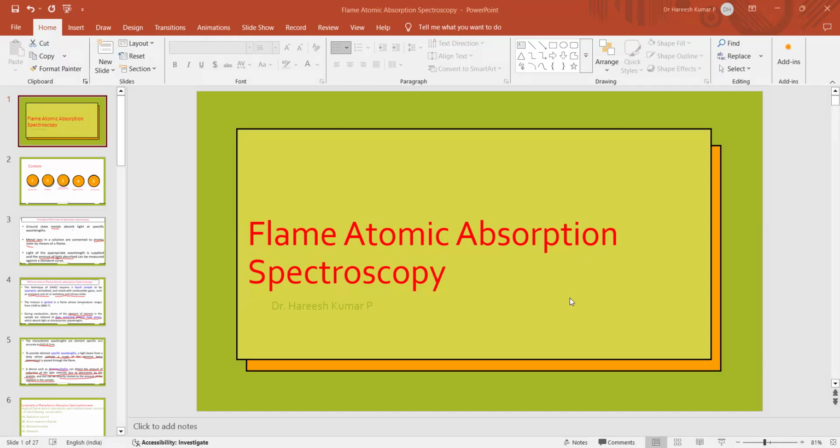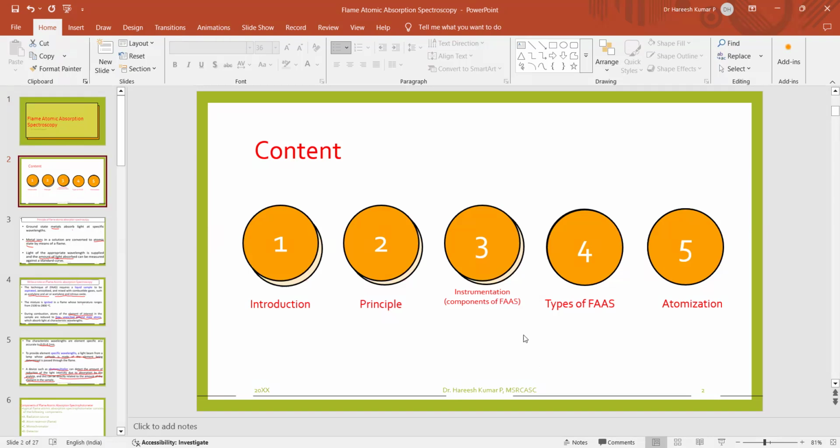Okay, today let's discuss flame atomic absorption spectroscopy. Let's look into the content of this video lecture. The content contains an introduction about flame atomic absorption spectroscopy, the principle involved in it, and instrumentation, more particularly the components of flame atomic absorption spectroscopy.